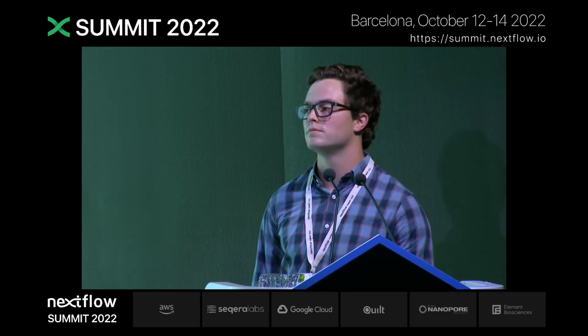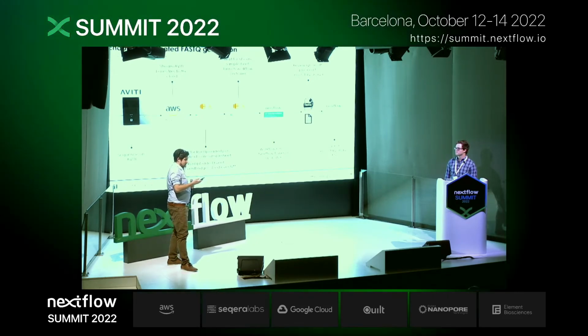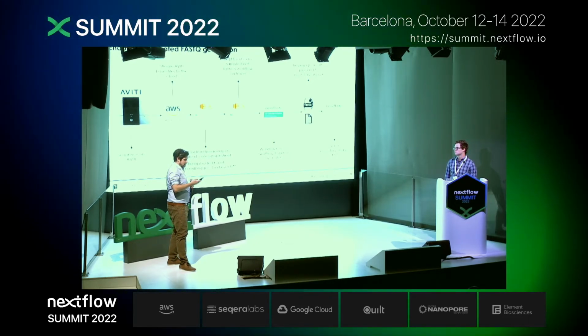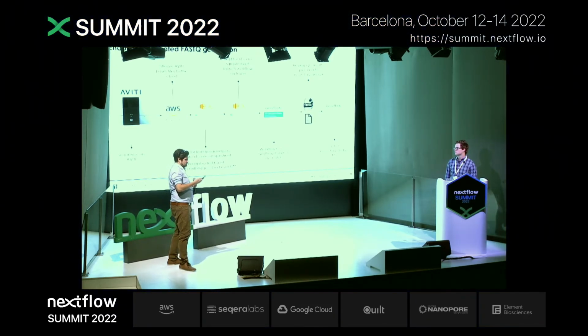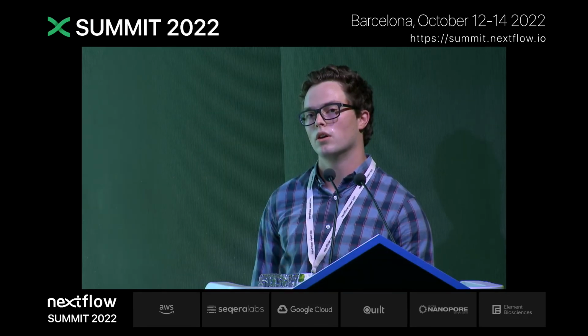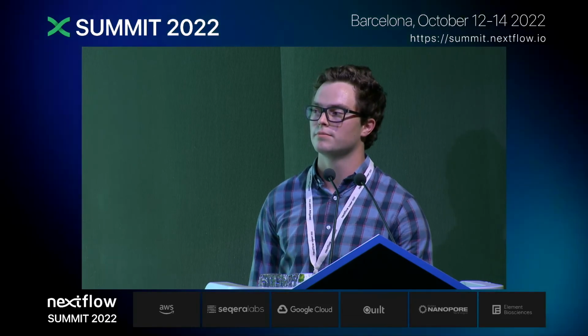Okay, awesome. There's a comment from Alex: really appreciate the strong emphasis on the platform openness and the possibilities for integration. And one final one from Christian is asking, is the Bases2Fastq binary also available for ARM? He only found a version for x86. I don't know if we have an ARM Docker image built yet, but if you're interested in that, feel free to reach out and we can definitely see if we can make that happen.